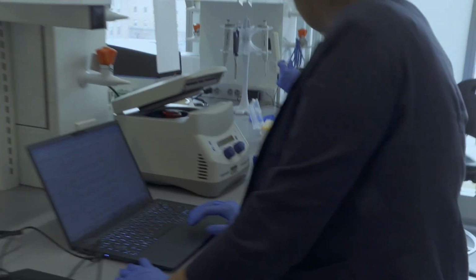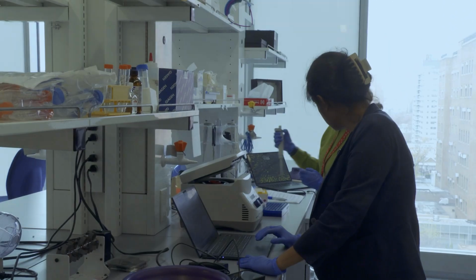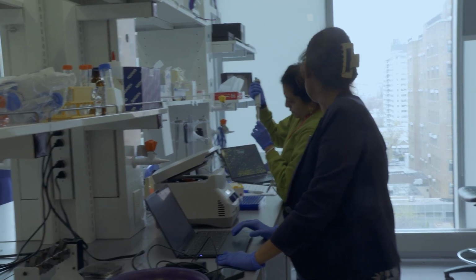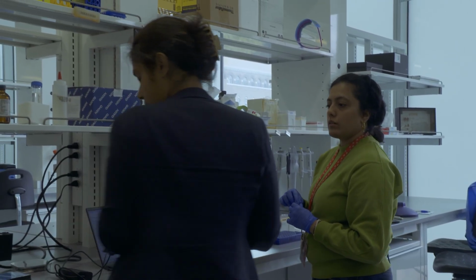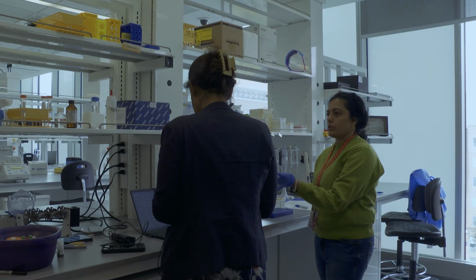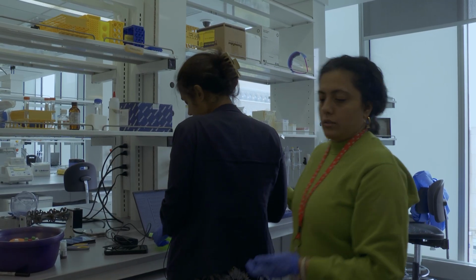And you don't. So just pipette, right? Just swipe it a few times. That should be enough. You mixed the enzyme. Do you have like ice or cold for the Eppendorf tube or PCR tubes? I'll put it on ice. Give it to me.